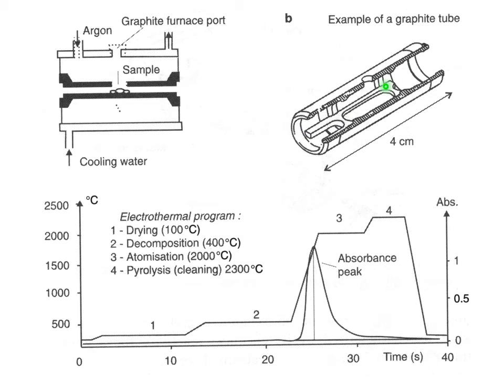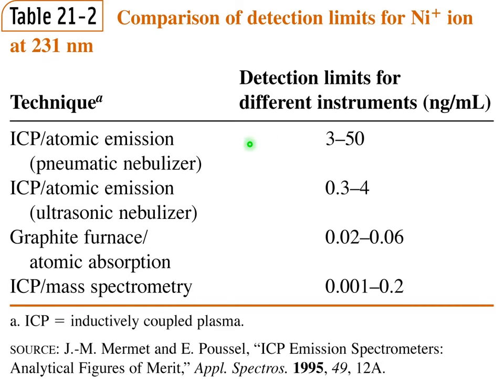The tube is not a very simple device. It has several improvements that help vaporization of the sample. So we have several different methods. We can look at them and compare how good they are.